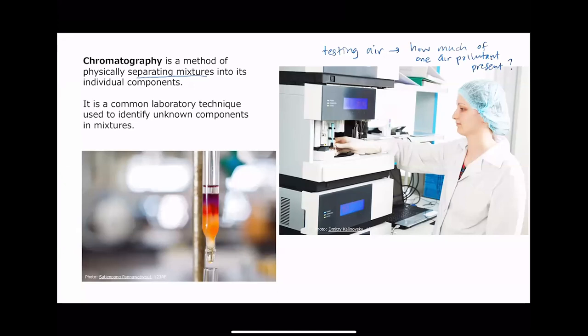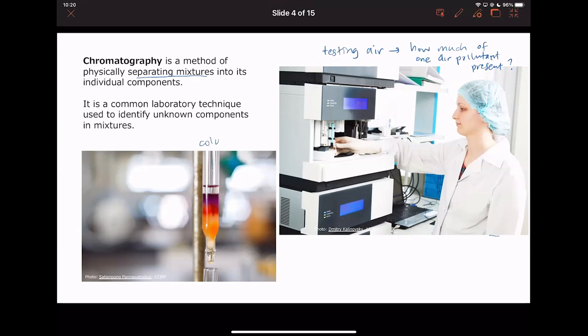Another thing that chromatography is used for is isolating new compounds in drugs. If you're going to work at a drug company, even not as a laboratory tech person like her or a researcher, you might be part of human resources, or you might be part of the marketing campaign of a new drug. Well, you can understand a little bit about part of the process if you've taken Chem 9, which is very important in determining new drugs. Is once you make your drug, usually you have to separate it. So this is a column.